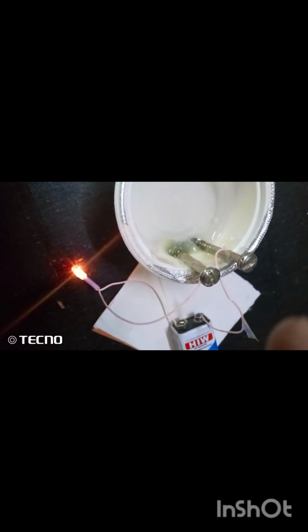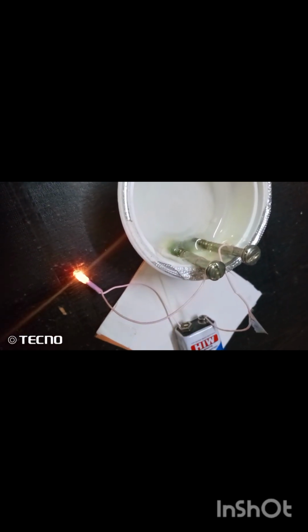Now let me explain why the metal from the anode deposits on the cathode. It is due to the fact that from here to here, positively charged ions, which are known as cations, get transferred into the conducting solution, and here in this wire negatively charged, I mean whatever it is, anions go through this cathode.